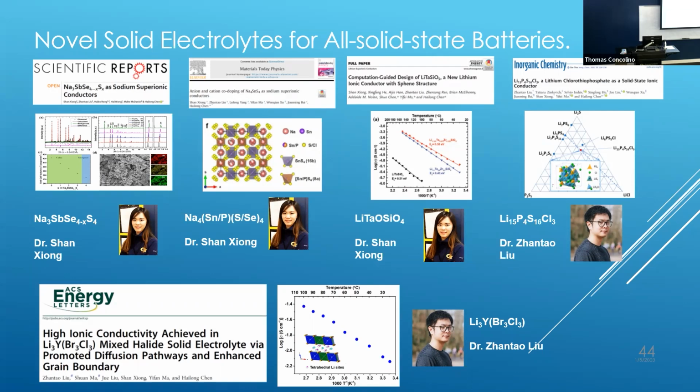That's cool, Hailong. Building off that, I also had a question about kinetics. When you showed the in situ synthesis, you were saying how it saved a lot of time being able to map out phase formation as you heat it up. I wondered to what extent the results you were getting were a consequence of thermodynamics versus kinetics. Are those lower temperatures actually at equilibrium, or are they phase assemblages that are a consequence of kinetics, like the lithium carbonate melting at low temperatures?